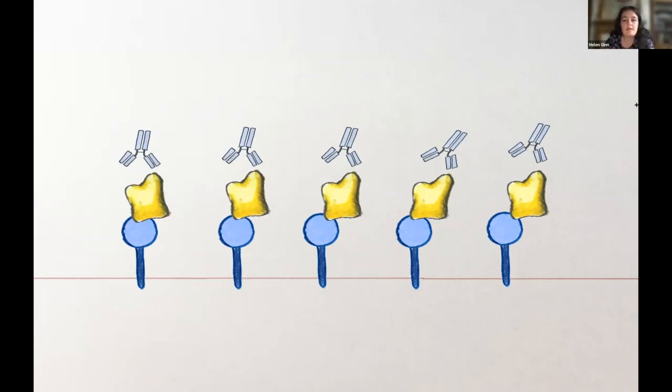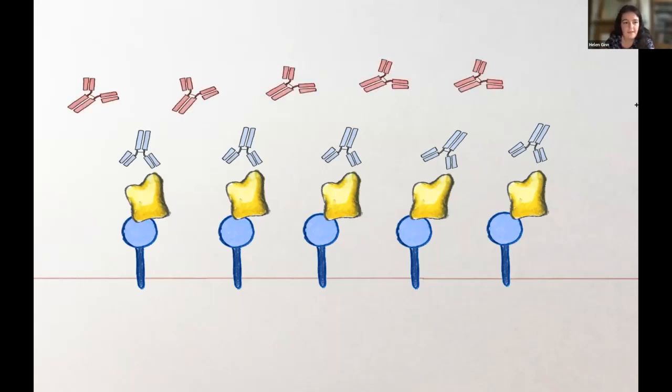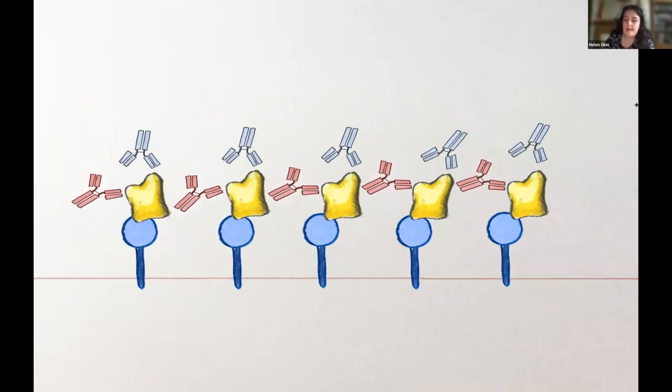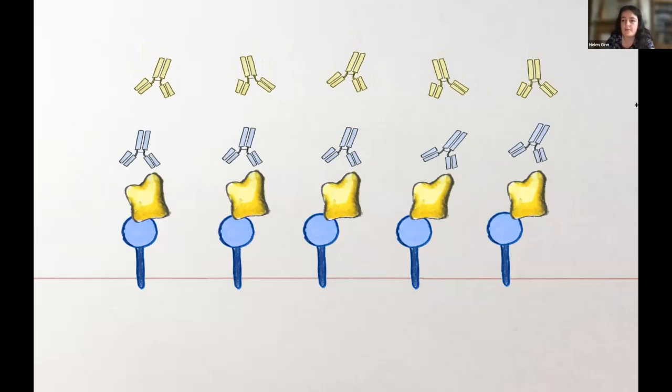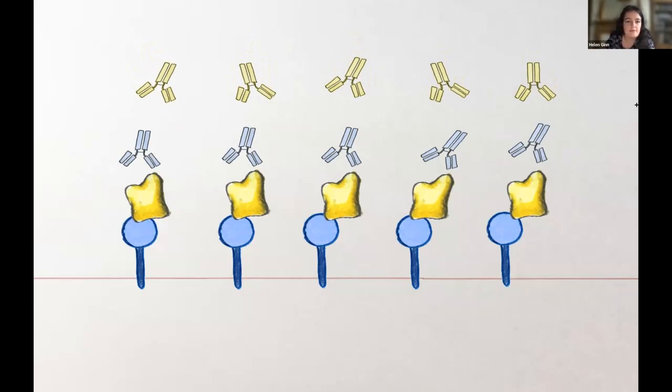And once we introduce a second antibody that's been isolated, it may or may not be able to bind at the same time. If it's able to bind at the same time, we'll see a 200% signal boost. So they don't compete, they're not binding to the same place in the receptor binding domain. Or we may choose an antibody which has to bind to the same place and is therefore unable to do so, in which case we'll just stick to a 100% antibody mass signal boost.